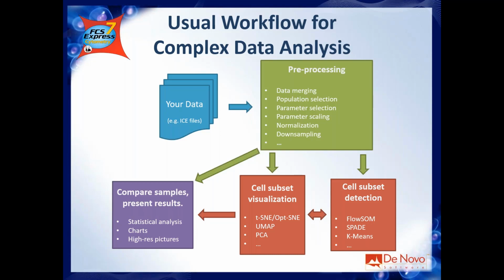So the clustering will access the output of UMAP 1 and 2. If you run the clustering and UMAP as standalone algorithms, they will not speak to each other. They will be independent. So the beauty of the pipeline is that you can combine those algorithms into the same workflow.